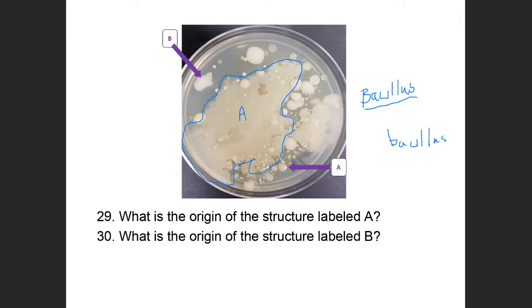So everything that we've talked about in Unit 1 is fair game. There'll be questions about ubiquity. There'll be questions about hand washing. There'll be questions about fluid thioglycolate. There'll be questions about candle jars and anaerobic jars. There'll be questions about ambient conditions. There'll be questions about media and the percentage agar that's in a solid, 2% versus a semi-solid, 0.5% versus a broth, 0%. What percent of agar is in thioglycolate, 0.05%.